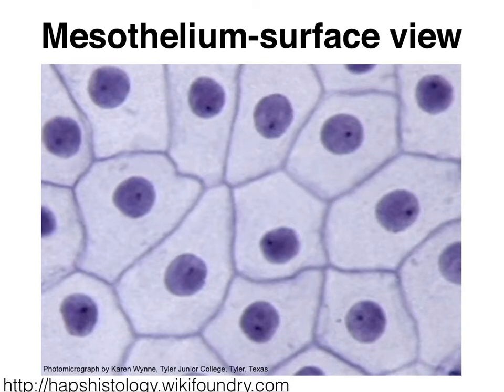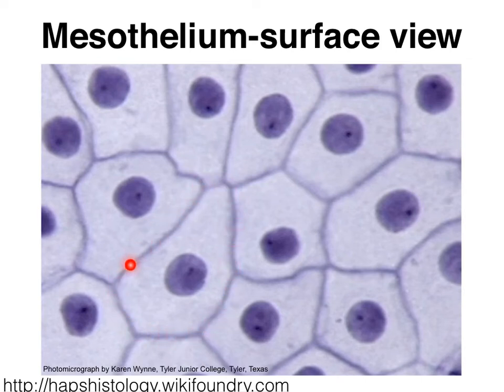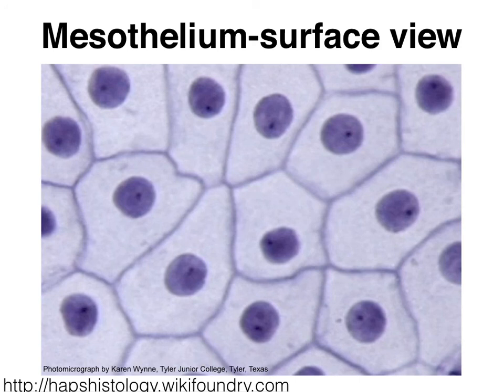In the previous slides, we looked at longitudinal views of simple squamous epithelial tissue, particularly in the form of mesothelium. This time we're looking at a surface view of mesothelium. What that means is that you need to pretend that you're hovering in a little helicopter, hovering over the mesothelium and looking down onto the squamous cells. We see individual squamous cells that now look more like little puzzle pieces, because we're not looking at them from the side anymore — we're looking at them from the top. Inside each cell, we very clearly see a distinct nucleus with a nucleolus, the darker spots. The reason why we can see these nuclei so well is because this is simple squamous epithelial tissue.